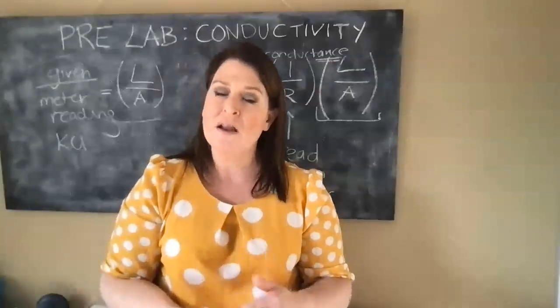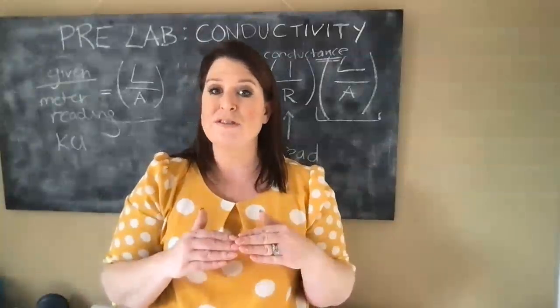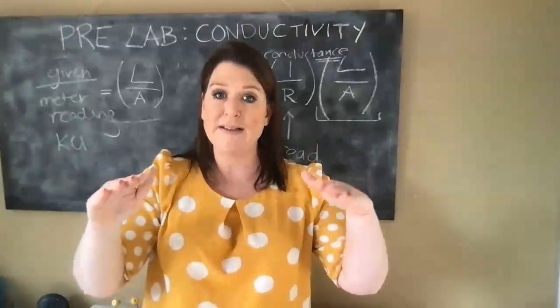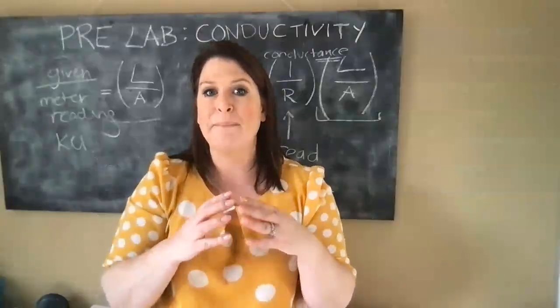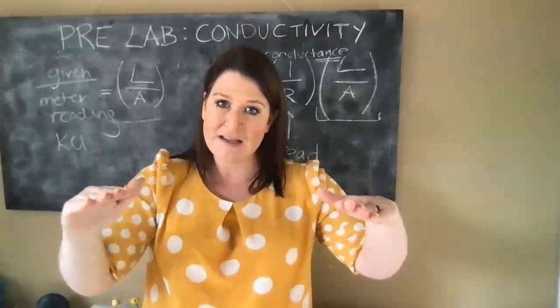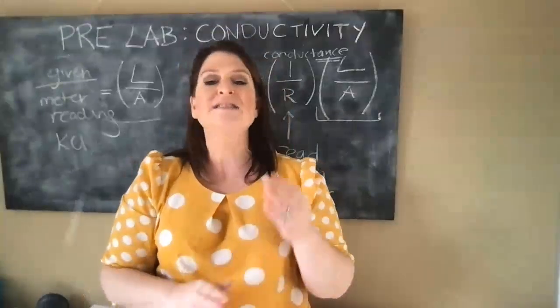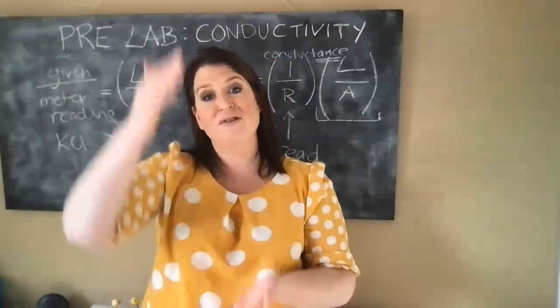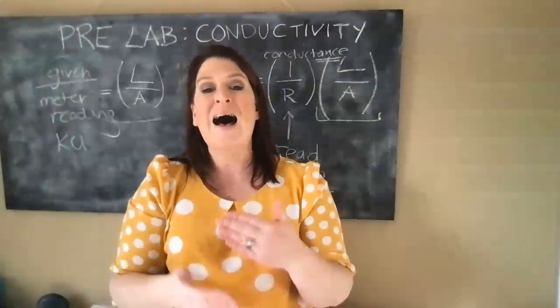So for that reason, in part B of the experiment, which is the comparing and contrasting of the different solutions, it is imperative that you try to minimize variations from external forces, such as differences in temperature, so that all the solutions are tested at a similar temperature, and we've gone for 25 degrees. It's not so important for the conductivity titration, because it's the same solution. They'll have been left out at room temperature, so they're all at the same temperature.